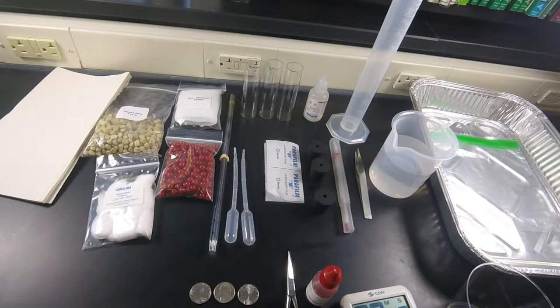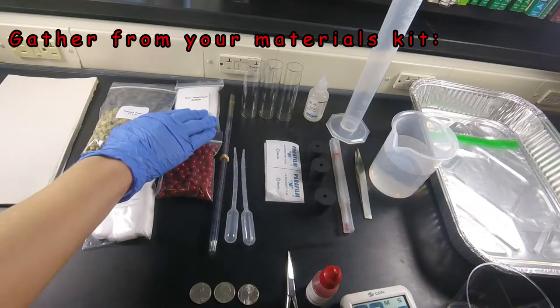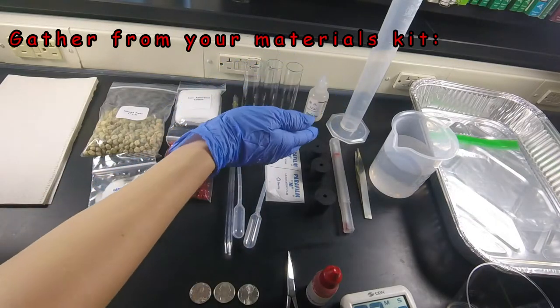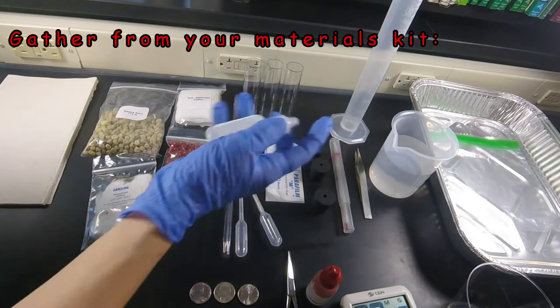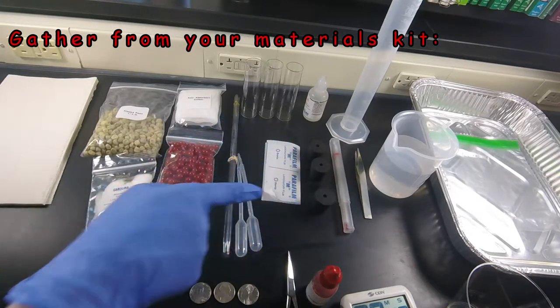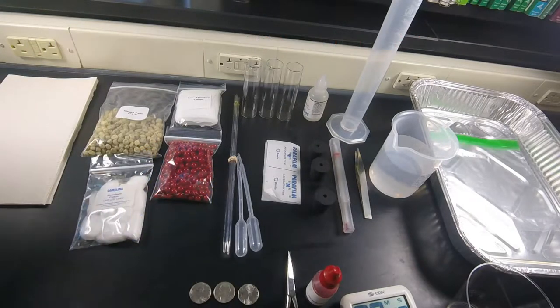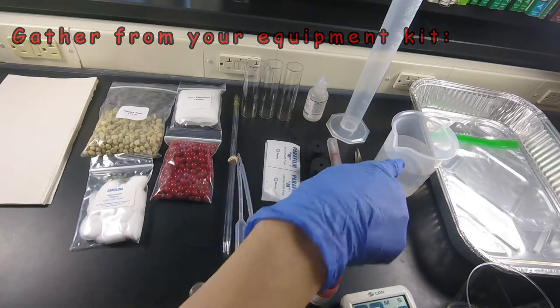Before you begin, please make sure that you have all of the materials required for the lab. From your materials kit, you will have garden peas, non-absorbent cotton, 3 glass pipettes, 3 flat bottom glass vials, 2 plastic pipettes, potassium hydroxide, 4 parafilm squares, 3 rubber stoppers, 200 beads, and 10 cotton balls. From the equipment kit, you will need a graduated cylinder, thermometer, and a pair of forceps.